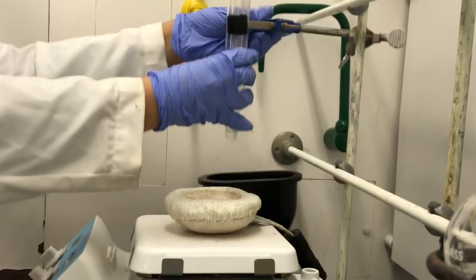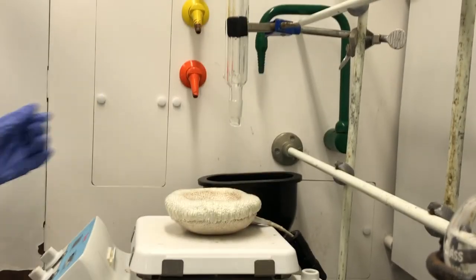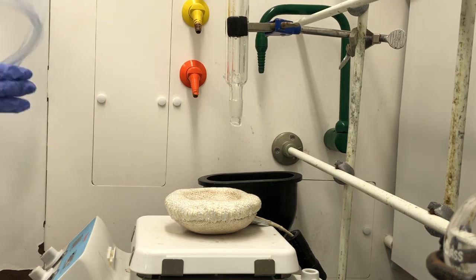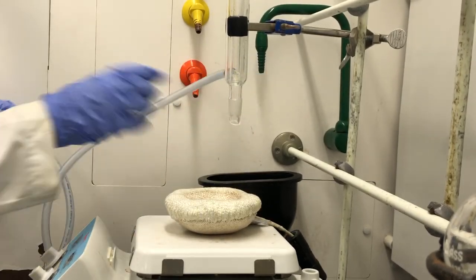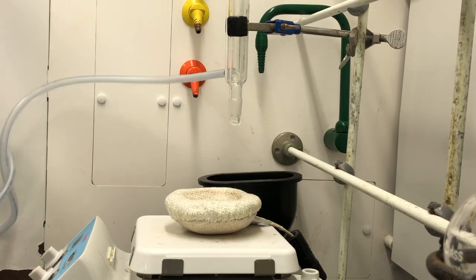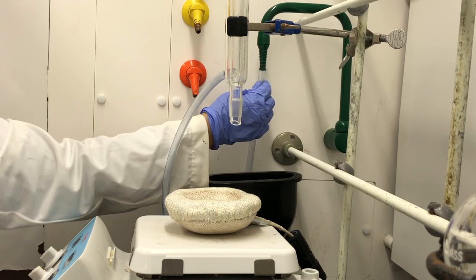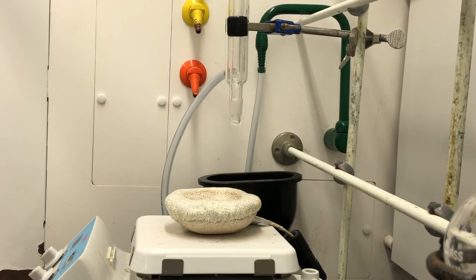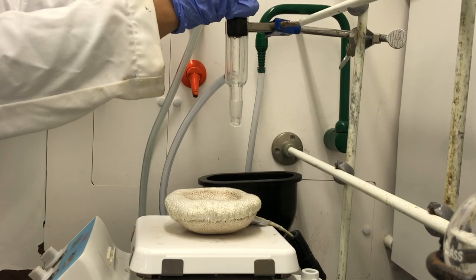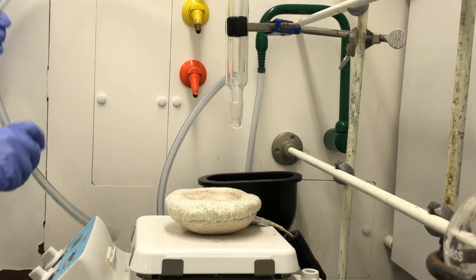Set up the condenser vertically. Then we'll attach the clear tubing for the water. You want the water to be flowing from the bottom of the condenser to the top, because you want the cool water coming in to cool down the vapors from the solution. The green tap connects the water, and then water flows out from the top right into the drain.